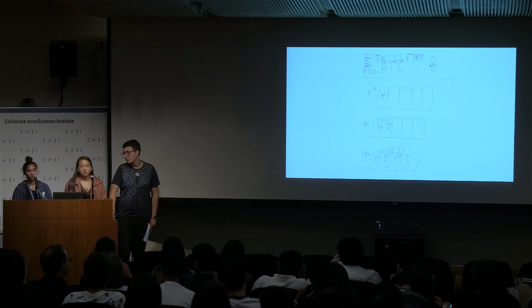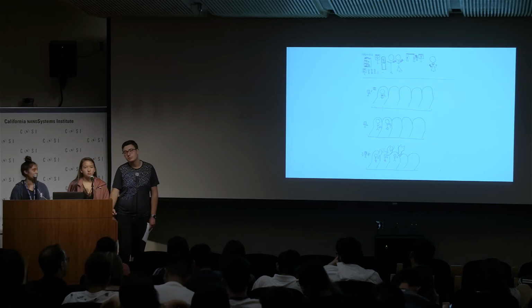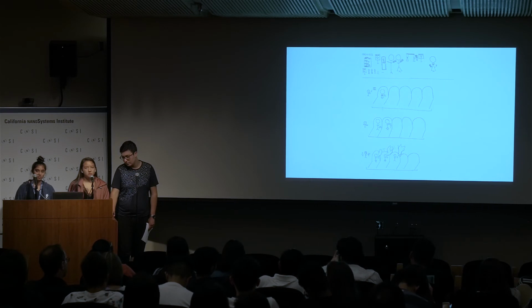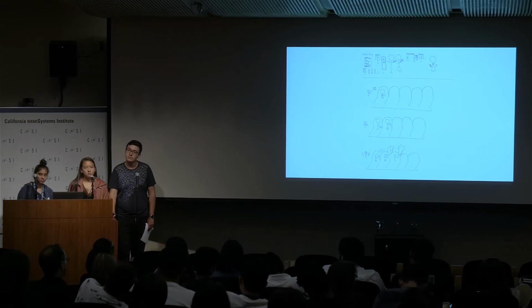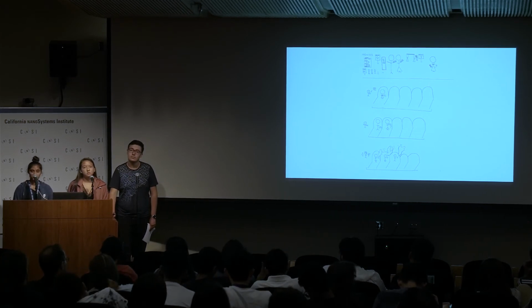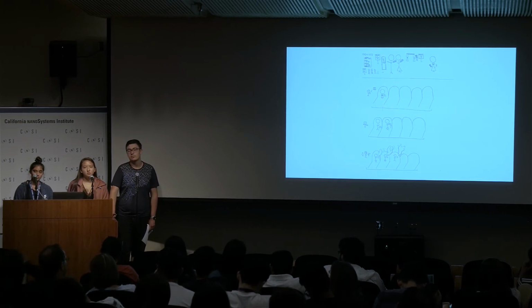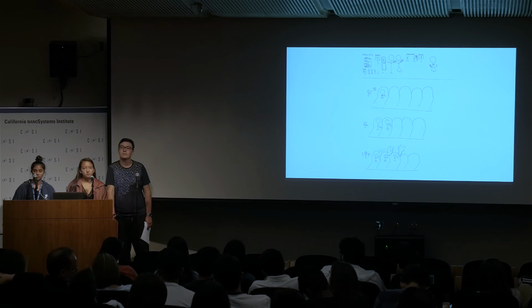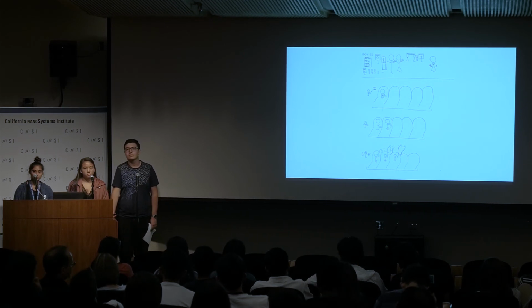Well, okay, so I guess what I'm trying to ask is, you were saying that the price of the ticket is trying to show the size of the silver, right? But the free one here is the one that goes in the easiest. But the charge on the particles is another thing, right? As we saw from the previous group that showed this experiment, the charge on those ions is something that's preventing them from getting in the cell. How could you think that they could show that?